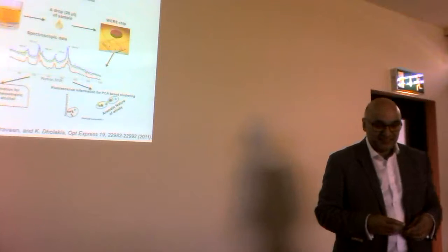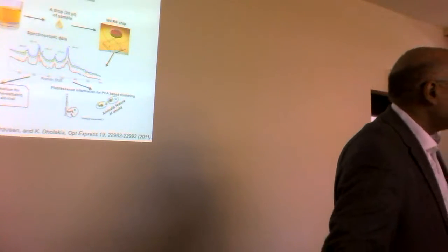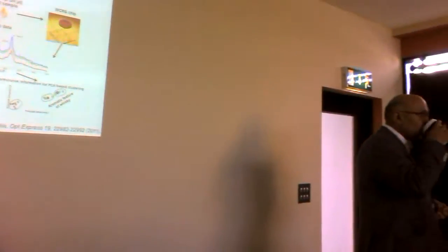Yeah, and then there's also differences between this kind of Raman being used in tissue and that being used in, let's say, pure white substances. And even in that, we have a colleague in Galway who has a 30-page document for how to take those samples out of the fridge. Physically, just taking it out of the fridge, and all of the parameters and possible environmental things that could affect the signals you get.